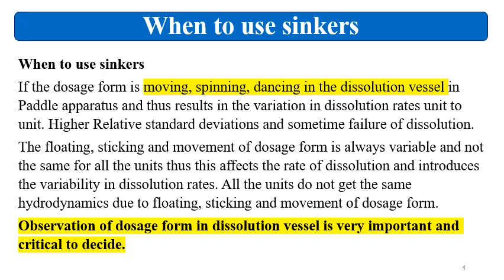Then if the dosage form is moving inside the dissolution vessel in the media, or it is spinning or dancing in the dissolution vessel in paddle apparatus, and thus results in the variation in the dissolution rates unit to unit, then higher RSD will be there. If minimum and maximum values are changing due to the formulation movement, spinning or dancing inside the dissolution vessel, there will be high relative standard deviation, and sometime also it will give dissolution failure.